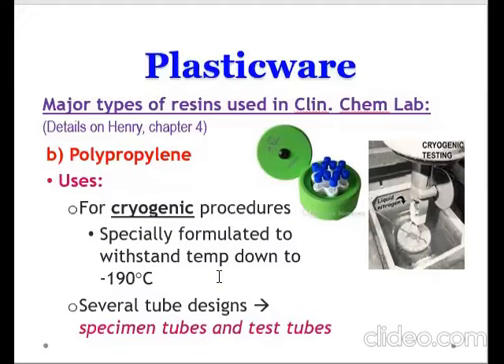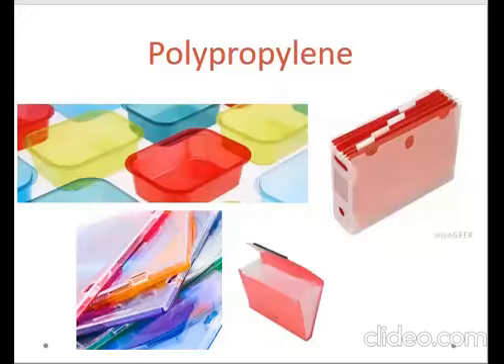Another thing, kung saan pwede po natin makita si polypropylene ay ito siya. Okay? I know familiar sa inyo ito. Ang iba dito makikita sa National Bookstore. Ito siya casing ng CDs. Ito kay Baunan. So nakikita po si polypropylene dyan.